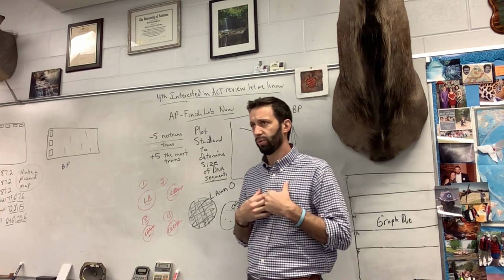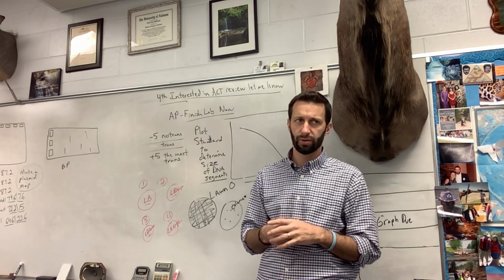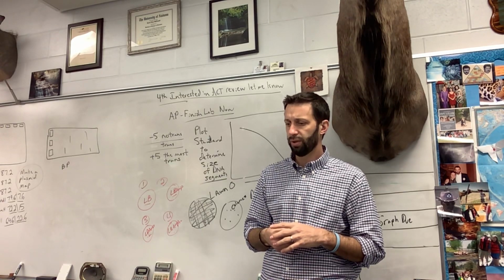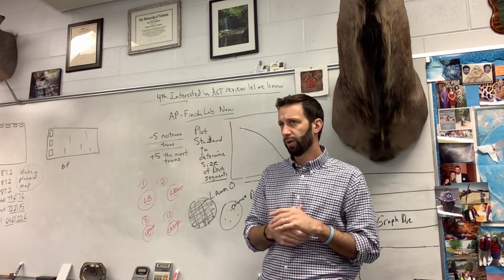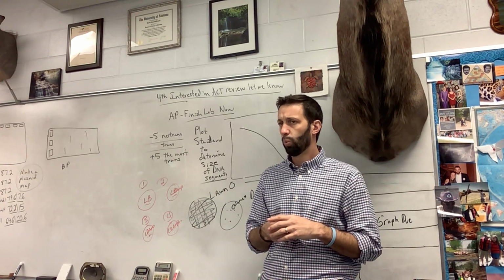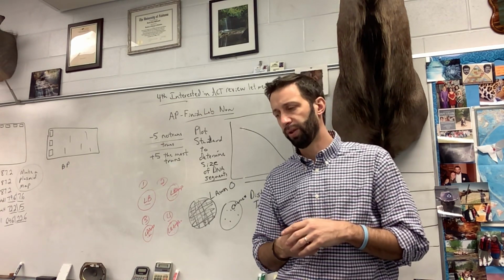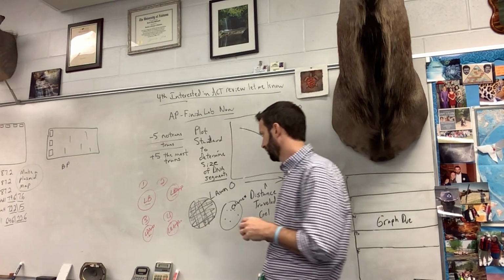I was really worried that this wasn't going to work because we poured the plates really thin and they kind of got dried out on the starter streaks that y'all did. But it turns out it worked pretty well. I think there was maybe 1 in this class that didn't work, and I think maybe the other 2 did. 1 was probably one of the best ones I've ever seen in terms of number of colonies on a plate. So I'll show you guys a little bit.